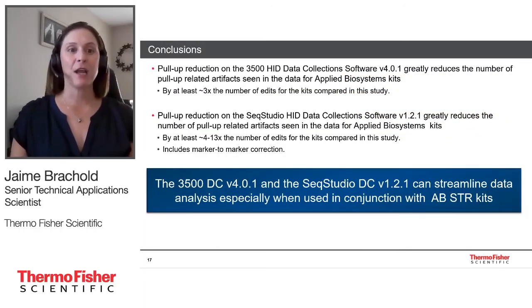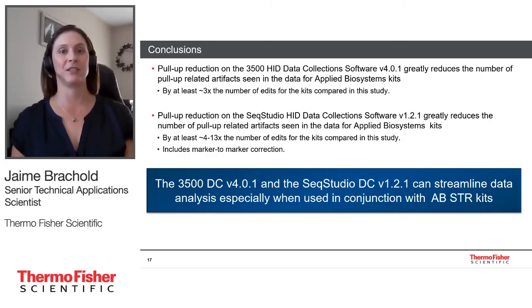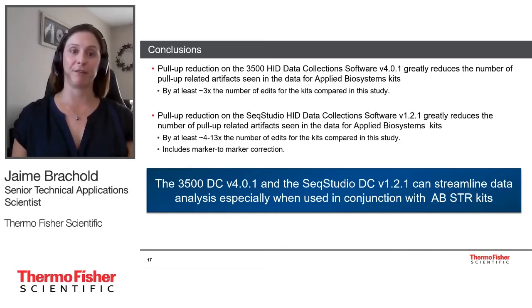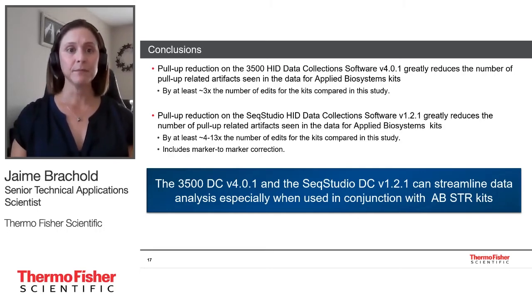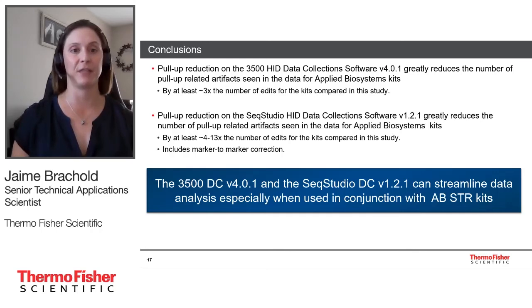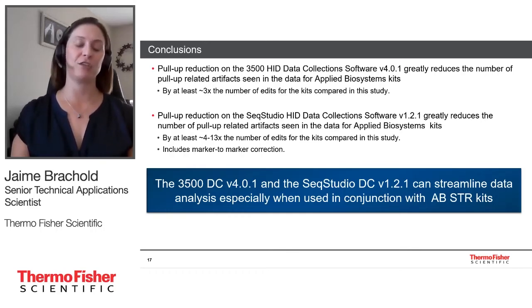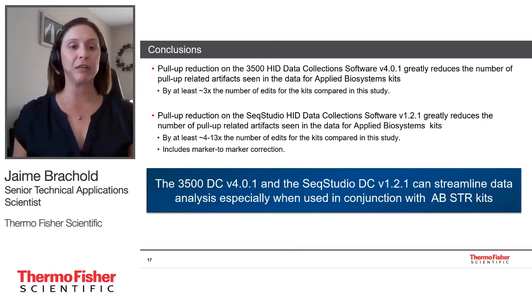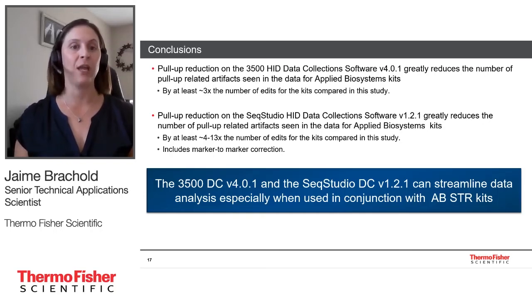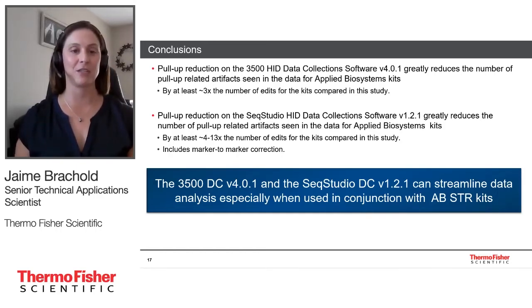In conclusion, pull-up reduction on both the 3500 and SEEK Studio with the latest data collection software versions greatly reduced pull-up-related artifacts for Applied Biosystems kits. On the 3500, it reduced pull-up artifacts by at least three times. On the SEEK Studio, depending on the kit, there was a four to thirteen times reduction in the number of edits. The SEEK Studio has the added benefit of marker-to-marker correction. Both the 3500 data collection v4.0.1 and SEEK Studio data collection v1.2.1 can streamline data analysis, especially when used with Applied Biosystems STR kits.